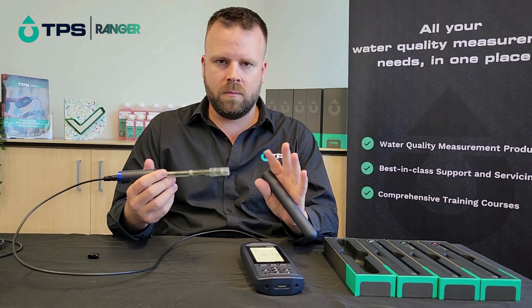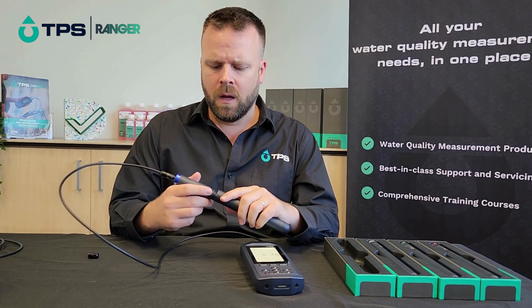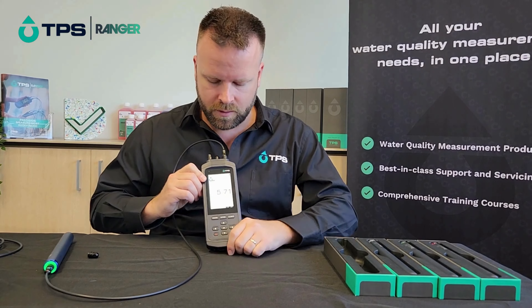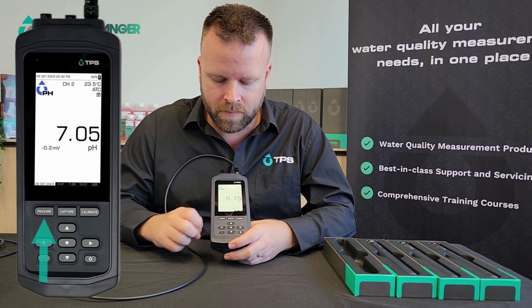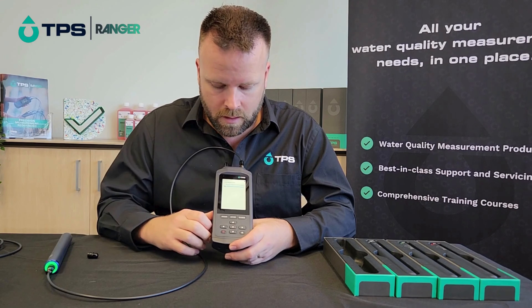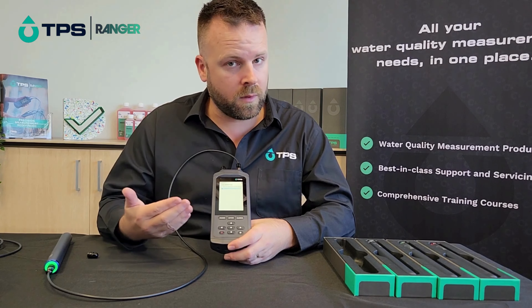You'll want to give the sensors a rinse and a clean and perform your first calibration. In order to do that it's very straightforward. The settings for the instrument are very simple — we've got our measurement screen which shows what's currently live, and we can go into calibrate and jump straight into the calibration screen, which gives you the option for which sensor you want to calibrate.